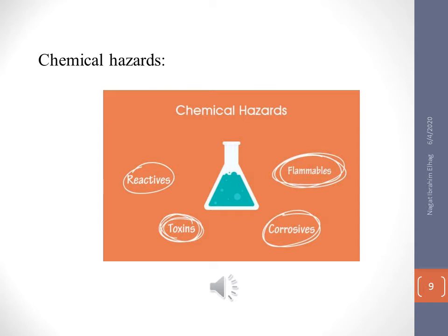So we have to be careful when handling these reagents, to avoid any chemical hazards such as fire inside the lab. Also, corrosive refers to chemicals such as acids.